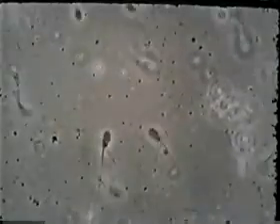Segment 6 comprises the upper half of the body of the epididymis. A few sperm are now capable of moving straight forward. Many still move in circles, but in most cases, the circle appears to be wider than seen in previous segments. Note that many show rotation of their heads as they move forward, but there are others in which the heads do not rotate. In these cases, the rapidity of flagellar movement gives the impression of vibrations of a tuning fork.